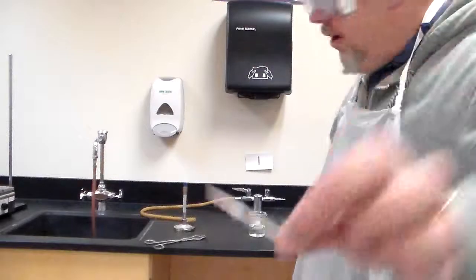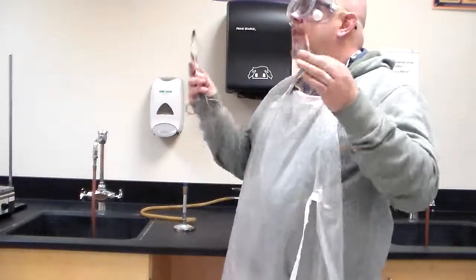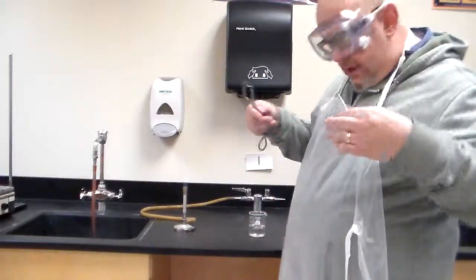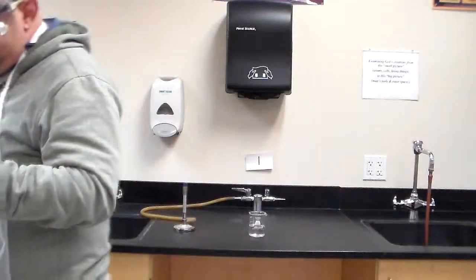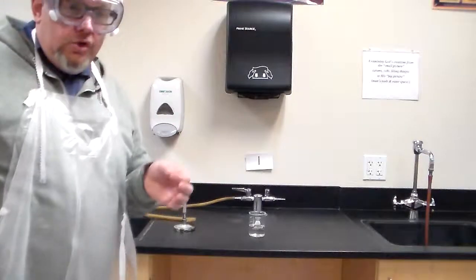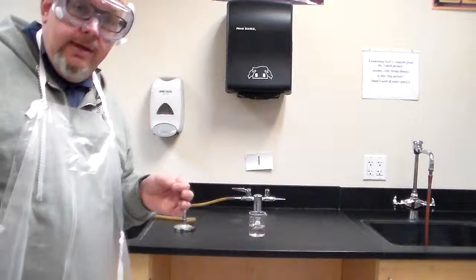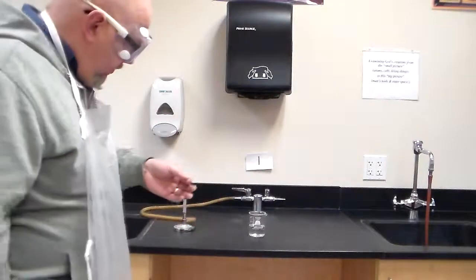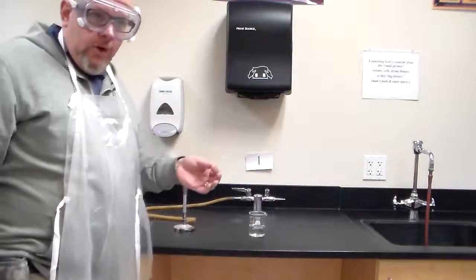You can take a quick look there. Okay, but here's the idea. The lab would be done in the dark because then you get to see the colors more, but for here I'm doing this as a way of let's get the light thing going. So here we go. Here's the idea of the lab. We're trying to identify what cation is being burnt off based off of the color flame that it gives.